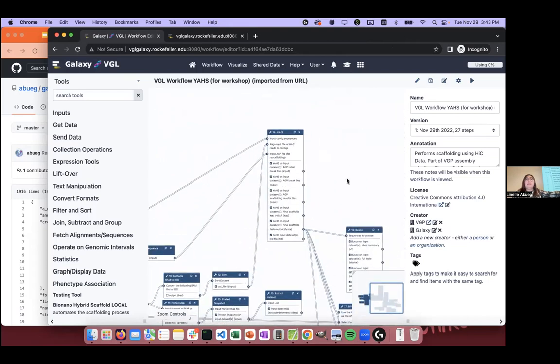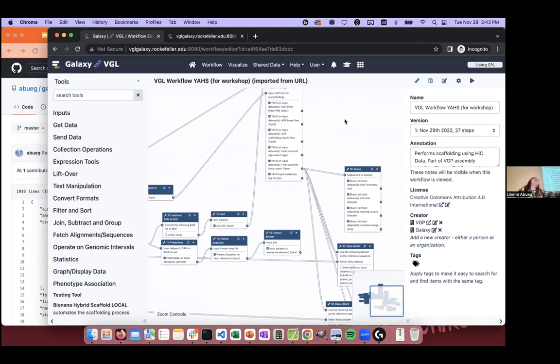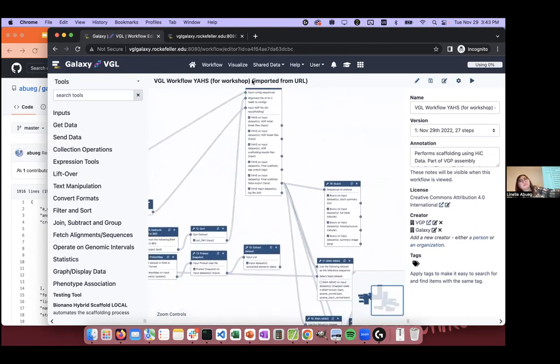The Hi-C workflow is a lot of involved pre-processing. You have to map the forward and reverse reads separately to your contigs, merge them, filter, sort, put that into Pretext map, get a Pretext snapshot out of that, put that into YaHS, get your final scaffolds, and then align again to those to get another Pretext map. So instead of doing that, we're just going to use the workflow.